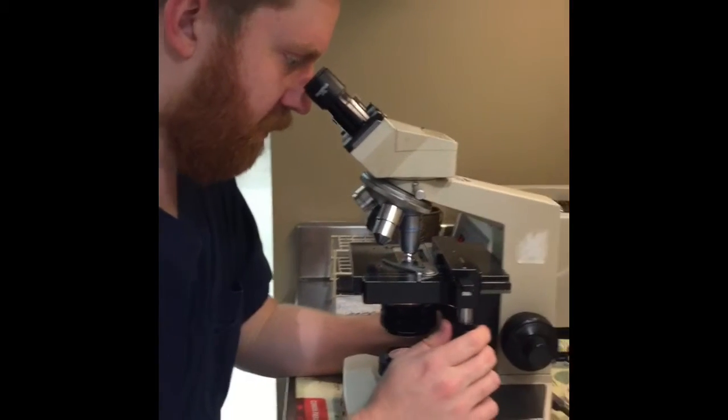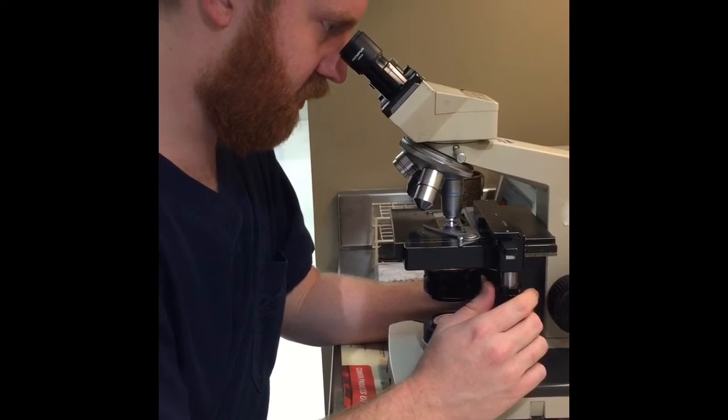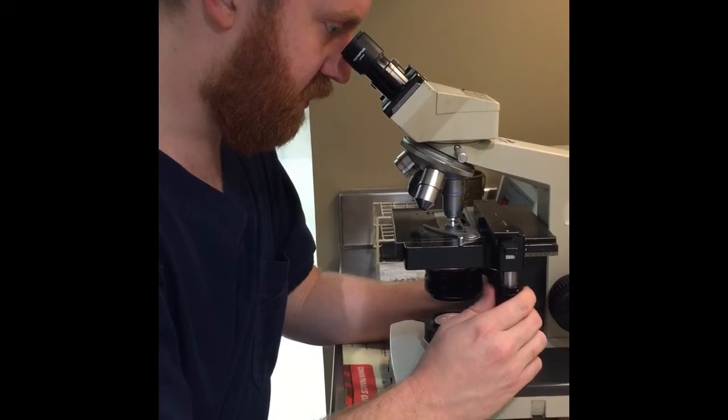I'm just taking a look at each different field here and kind of taking it into account. Because all I'm really seeing is red blood cells.